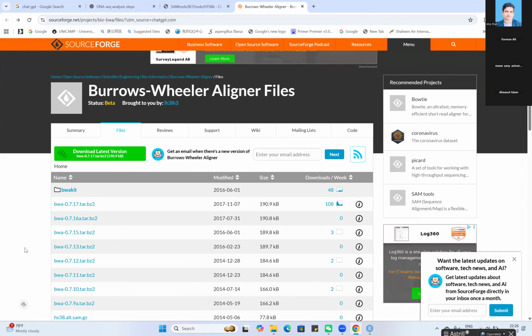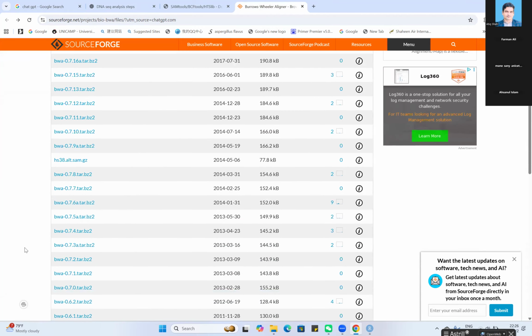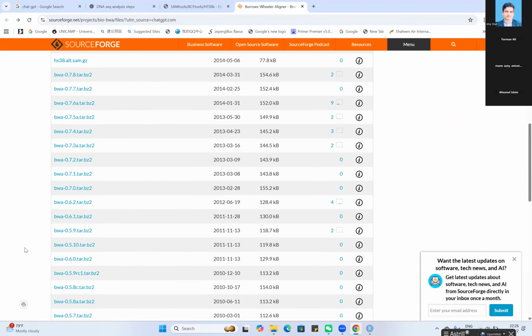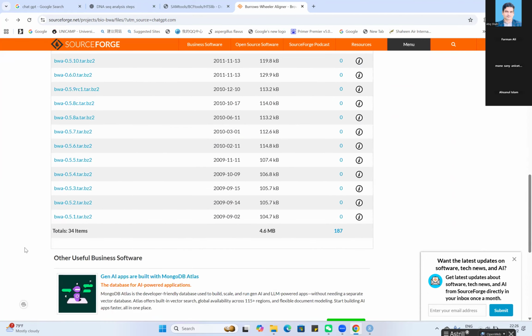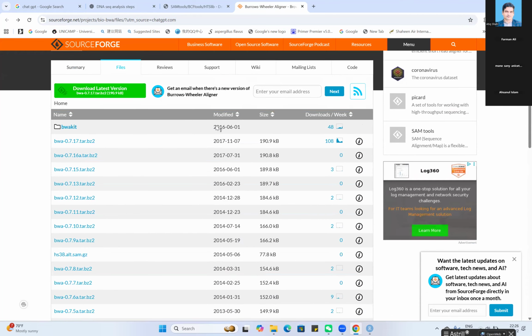Scroll down more. You can search date wise. So the latest is released in 2017. So open this, download this BWA 0.7.